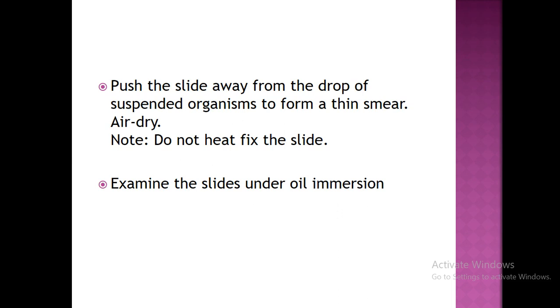But here the cells are not heat fixed, they are air dried, and then after air drying, observe the slide under the oil immersion objective. This is the procedure behind negative staining.